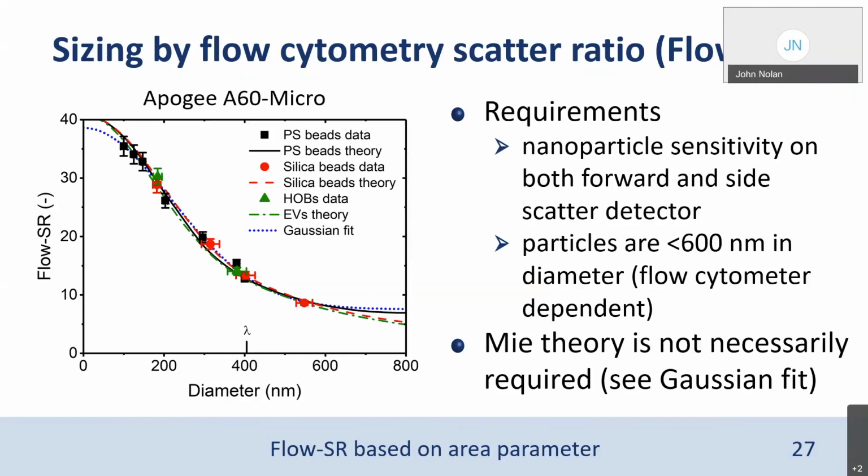Now, the most important reference beads which we use, and that we always start with, are NIST traceable polystyrene beads. I think they were named Duke beads, and now we buy them from Thermo Scientific. They are narrow, so they are monodisperse, and they come with a NIST certified diameter. Generally, they are stable for a long time. They come in high concentration, so we can use them quite long.